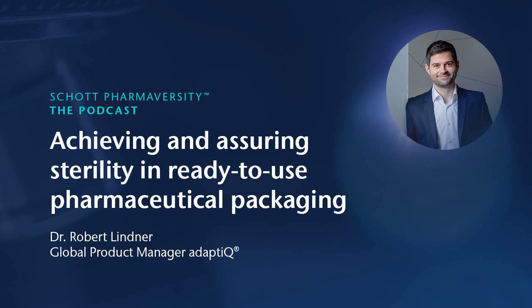In the end, this could be life-threatening, and this risk needs to be reduced as much as possible. Therefore, we need to ensure in the first place that we use clean materials for all products going into the finished pharmaceutical, but we also need to subject these materials to qualified and validated sterilization processes.